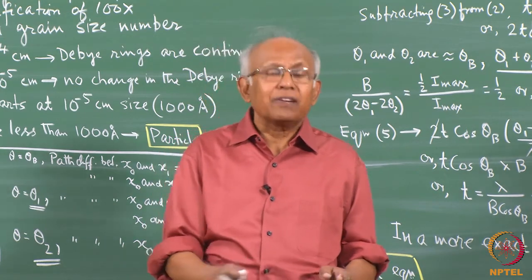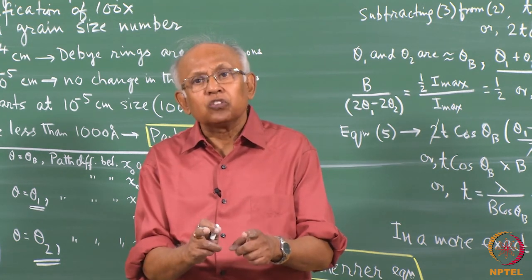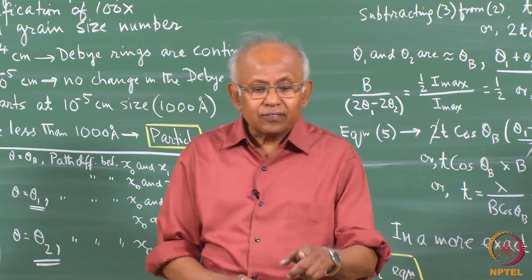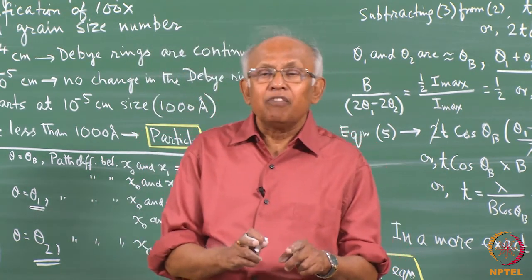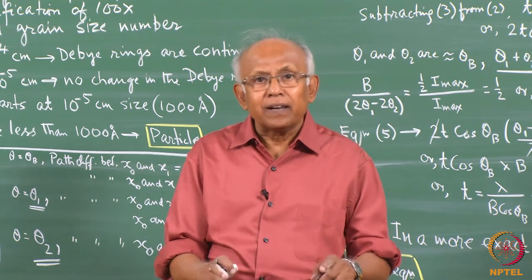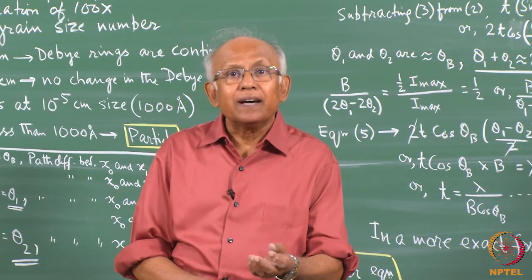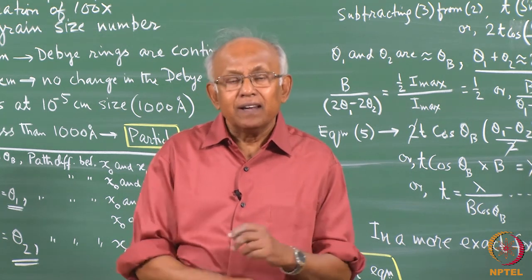So, if we measure the diffraction line profile, some of the breadth will also be due to the strain; there will be some strain broadening. Therefore, this method that we have described is not suitable for determining the fine particle size in polycrystalline sheet materials. It is good only for material where the powder is in a loose condition and there is no strain in the particles.